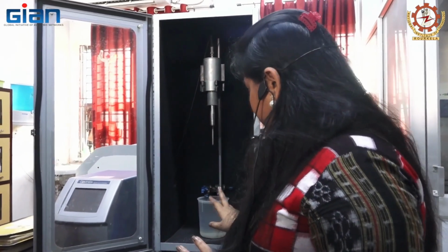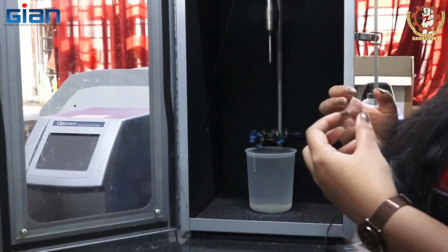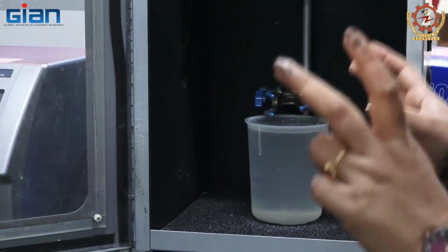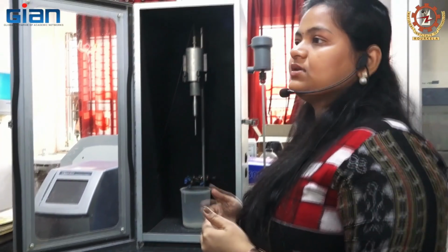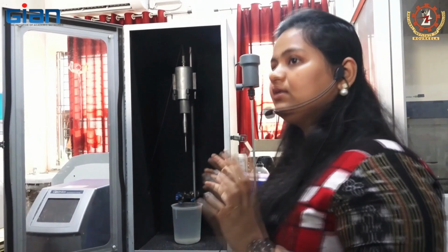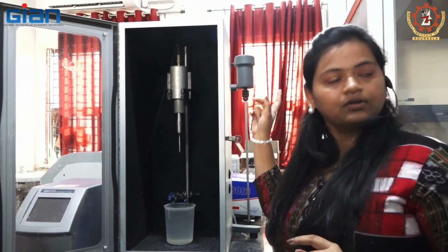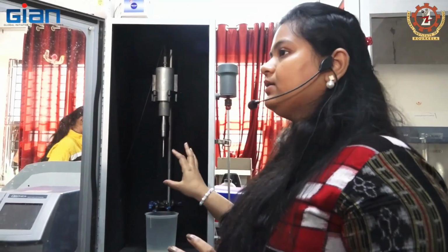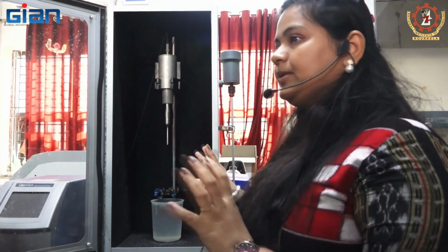Okay. How is the cooling system meant? Because in ultrasound there are bioactive compounds. If you are willing to extract the bioactive compounds, they can also be volatile in nature, and volatile compounds cannot sustain high temperatures. They need normal room temperatures. Switch on the light, switch on the ultrasound. Cool down the whole extraction process so that the volatile compounds can be secured well. Okay, got me? Then we will prepare the sample.